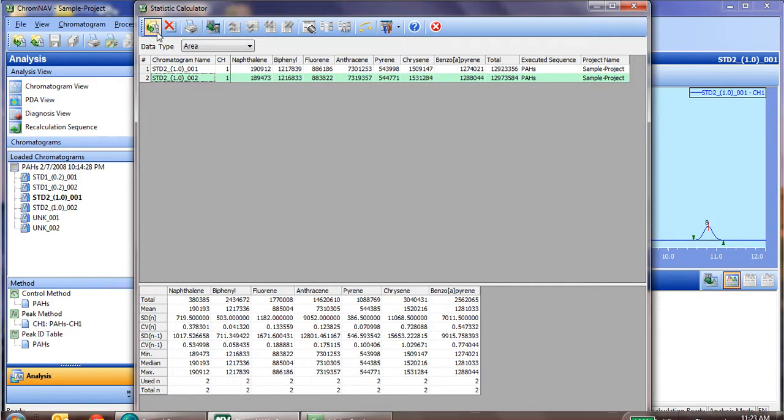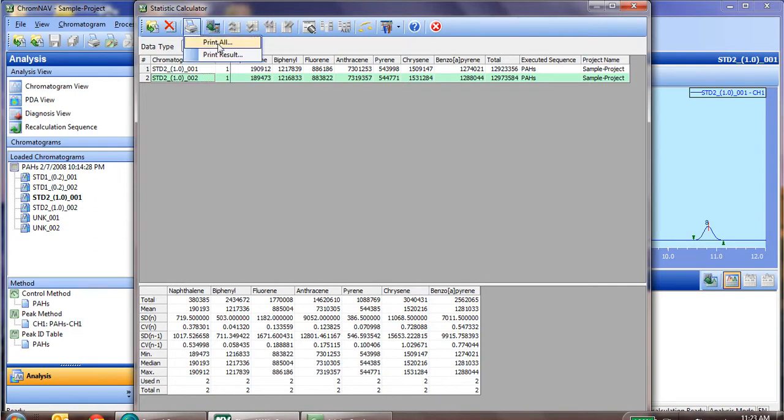If we'd like to print, we simply go to print, and you can print all, which means both the top and the bottom, or you can print result, which would print just the bottom section.